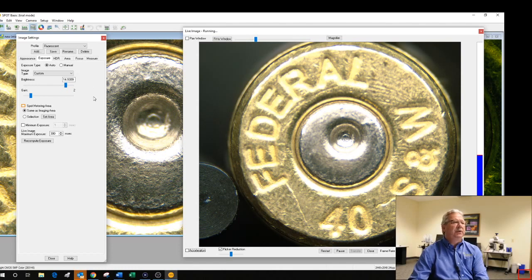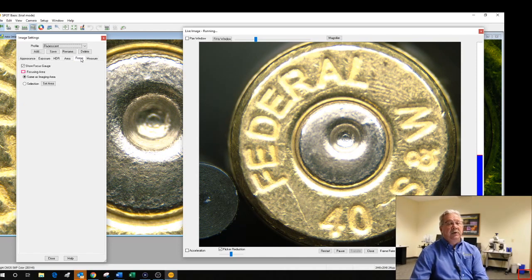I'm going to jump ahead. We're talking about the blue line here. There's 2 ways that you could use this focus gauge if you wanted. Number one, you can simply use it as it is and it's trying to determine the best focus across your full field of view. I only tell you that because it's going to include these little Delrin knobbies here from your universal holder and try to bring those in focus at the same time.